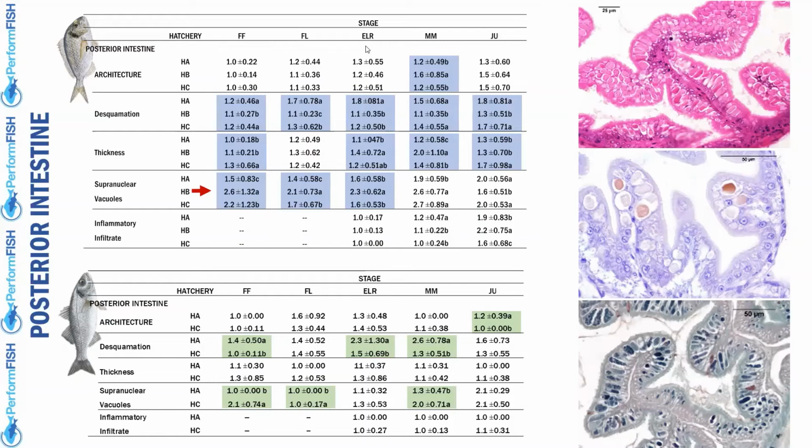Perfect, thank you. Because for histological evaluation, how many fish is necessary to try what this means. It is not a few fish. In general, when I perform other evaluations, I use 3 fish or 6 fish. But in this case, we have used 20 fish per batch.